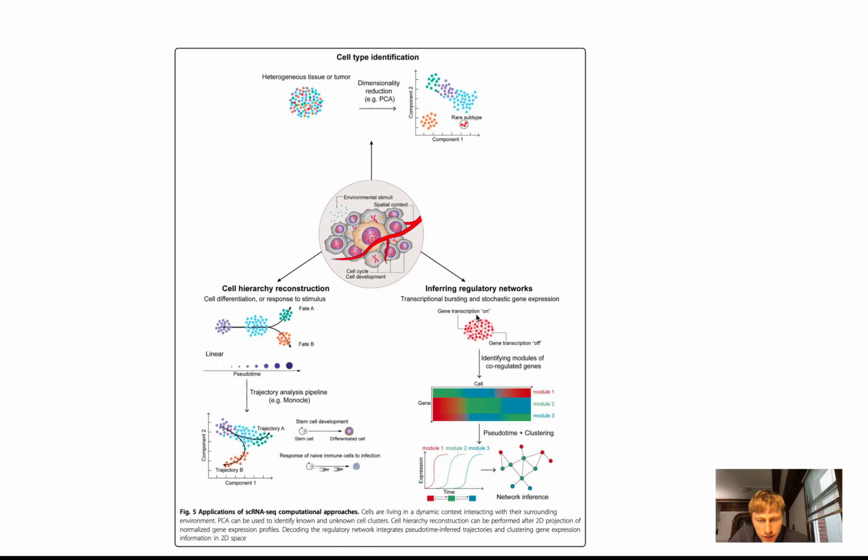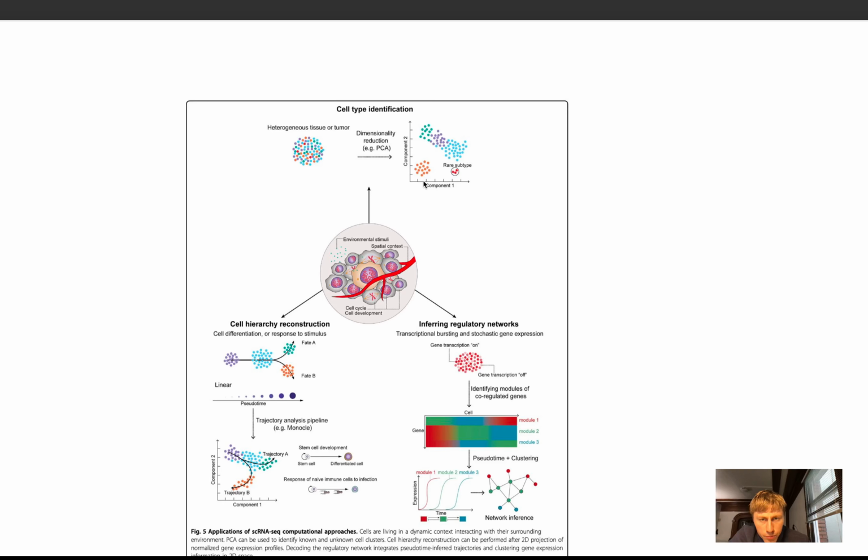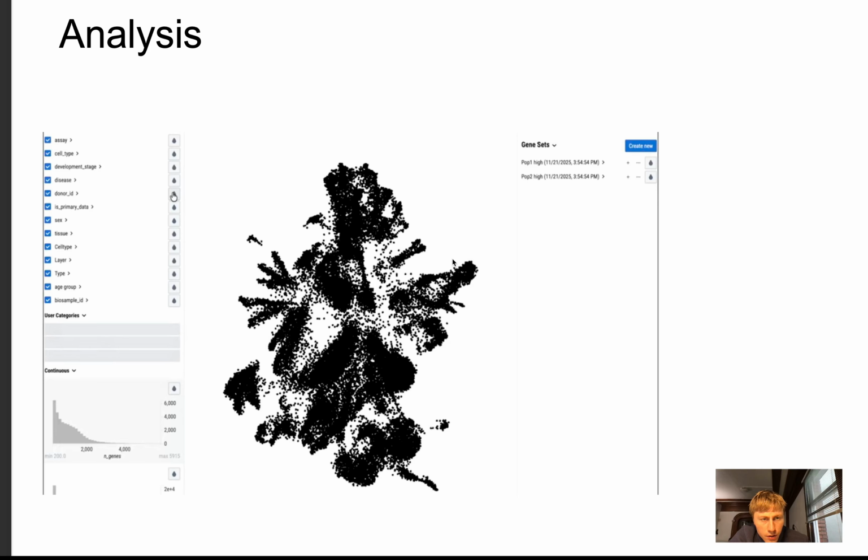Once you've done this, once you've found marker genes or did the clustering, a nice way to visualize this is to upload it to cellxgene, I think it's called cellxgene Explorer.